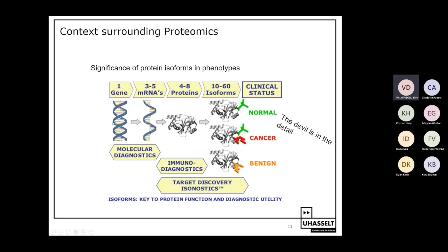Okay, so which technology are we now going to use to detect all these PTMs on the proteins? Because that's our ultimate goal, finding proteomic fingerprints or biomarkers that are predictive or diagnostic for some clinical status, or maybe to have personalized medicine, for example. So some patients would benefit from some therapies better than other patients. So that's what we want to achieve here with this discovery proteomics.